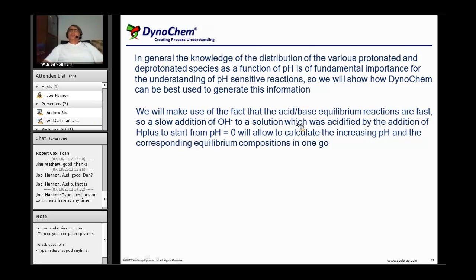In order to do so, we will make use of the fact that the acid-base equilibrium reactions are really fast. When we start with a system where we know that everything what can be protonated is protonated, in a very acidic part maybe pH zero, and then we add base till we get a solution where we have an excess of hydroxide, maybe one molar excess so that the pH is 14, then by slowly adding this we can go from pH zero to 14. Simultaneously, because of the fast reaction, we get the equilibrium concentrations of all these species as a function of the pH in one go.